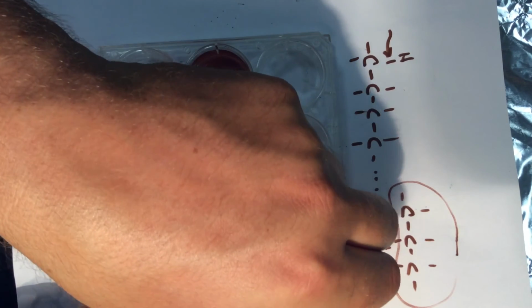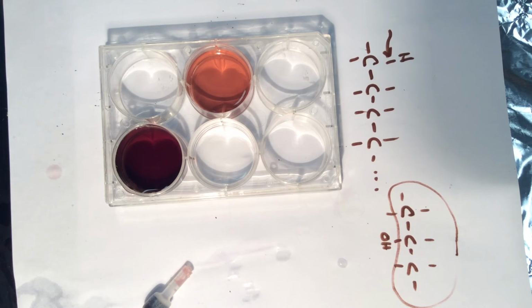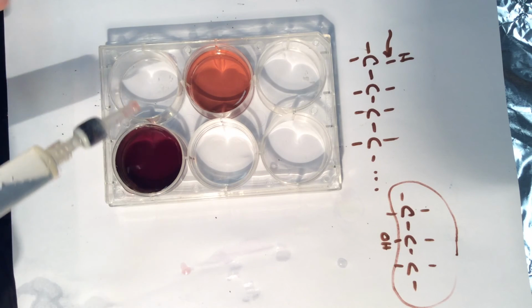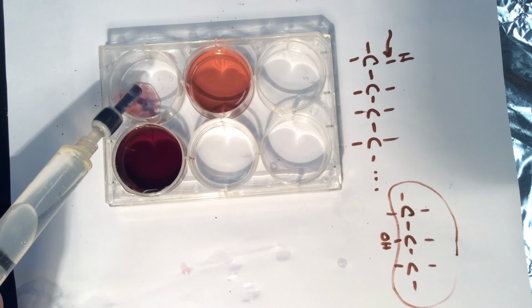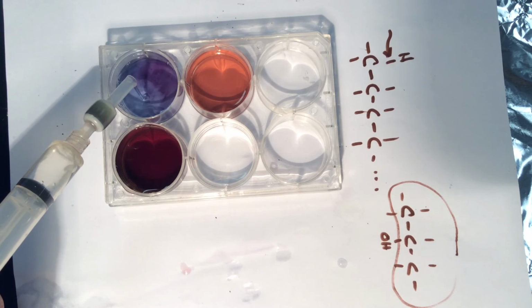Well, blue has a different solubility, so it's actually soluble in 25% solution, a little stronger. So I'm going to draw up some 25% solution. That's good enough. Short end goes in, and now I'm going to push out. And that's where the blue comes from.